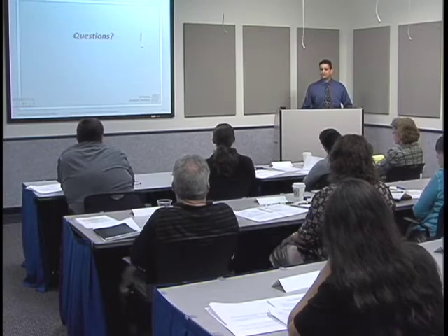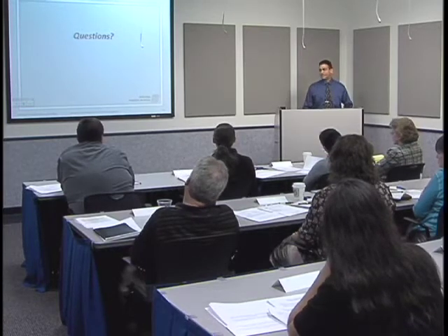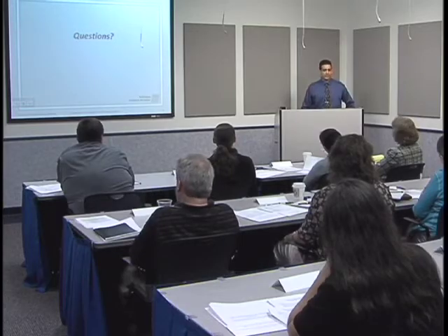Any other questions? I think the biggest thing with the validation is going to be interpretation guidelines. That's going to change for a lot of labs. Do you have any recommendations for people to do mixture analysis, based on what you saw in your studies, to put that into their validation?